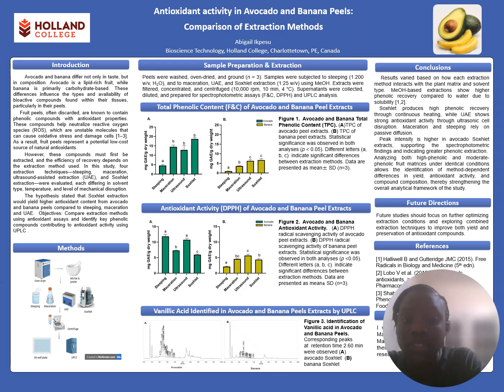My hypothesis was that the Soxhlet extraction will yield the highest antioxidant content from avocado and banana peels compared to steeping, maceration, and UAE. The objective was to compare the extraction methods using antioxidant assays and identify key phenolic compounds contributing to antioxidant activity using the UPLC.